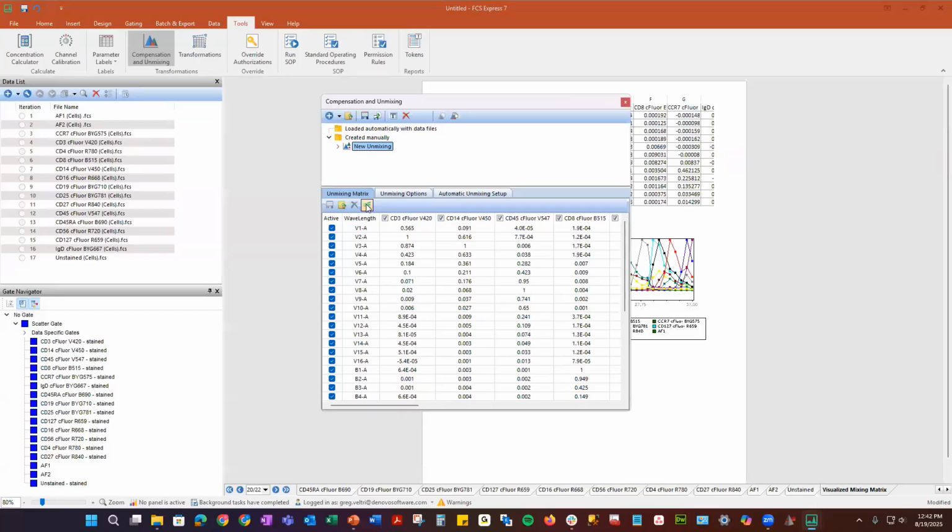So Easy Panel can then take the spectral information here. It will export to Easy Panel if you're using it. If you have questions about it, please ask us about it. We'll point you how to get a trial and things like that. But it allows these two to communicate with each other so that you can check how your spectrum is doing. And I know these are new tools that are developing out here, but we've really made a nice thing here to help you guys out.